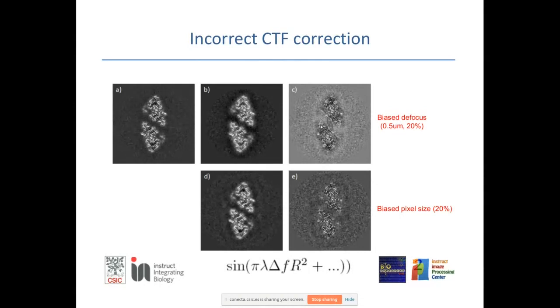So inside the structure, there are a lot of small details that are different between the reconstruction you can do with your best defocus and the reconstruction you can do with some defocus. And the same happens with the pixel size.